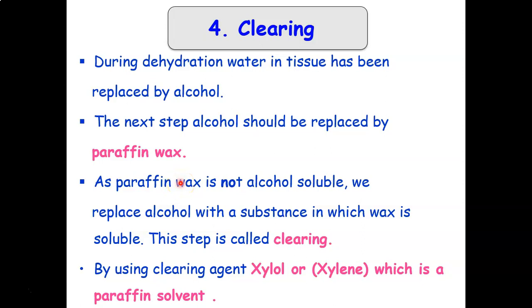So the scientists of histology searched for a certain chemical substance that can be miscible with the alcohol and miscible with the paraffin.